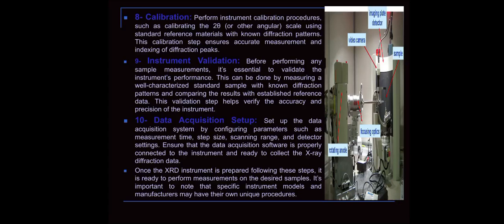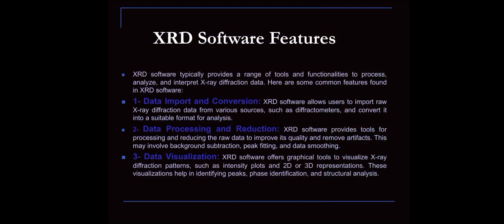Set up the data acquisition system by configuring the parameters such as measurement time, step size, scanning range, and detector settings. Ensure that the data acquisition software is properly connected to the instrument and ready to collect the X-ray diffraction data, and so on. XRD software features.